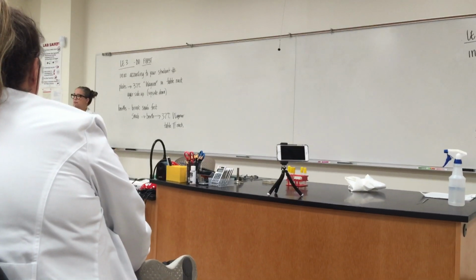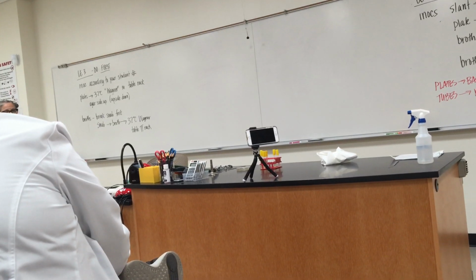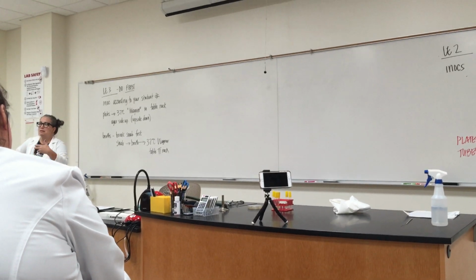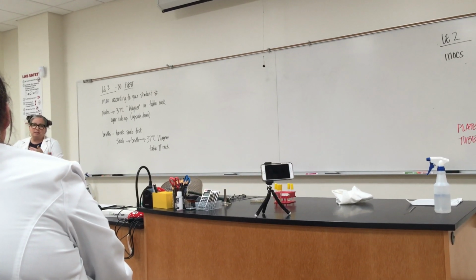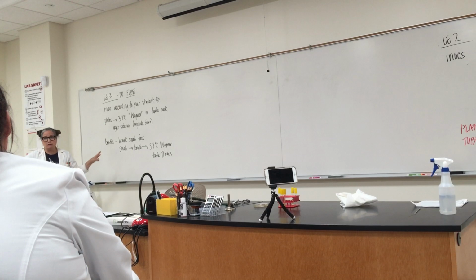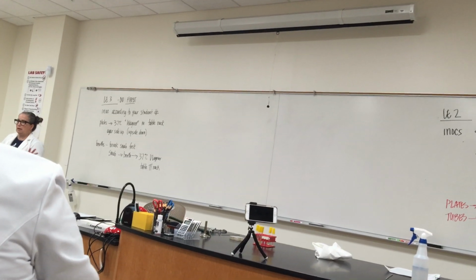We will not always perform them in order, right? Because I've done this lots and lots of times, I have found some ways of saving time. One of those ways that we can save time today is by starting the day's lab with lab exercise 3, because some of you have to let something sit out for 30 minutes. And you know what is a sad microbiology student? One who does everything and then at the end of lab realizes I now have to do a 30-minute something, where I sit around and wait for 30 minutes. So we will do this first, just in case you are one of the people that has to do that 30-minute thing, right? So lab exercise 3 is called microbial ubiquity.